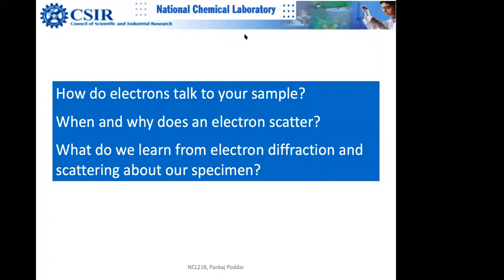What you look at is basically electron charge density. But here you are looking at electron and nucleus, electron scattering and electron-nucleus scattering. So that's how, when you solve the entire puzzle, you first look at the electron-electron interaction, you summarize it, and that is basically borrowed from X-ray people.